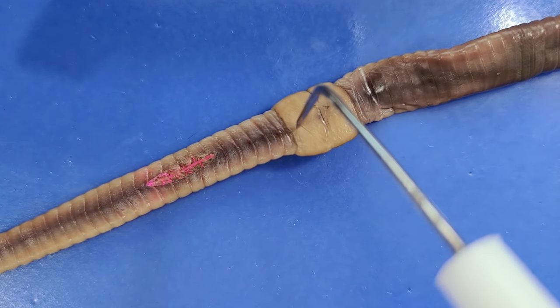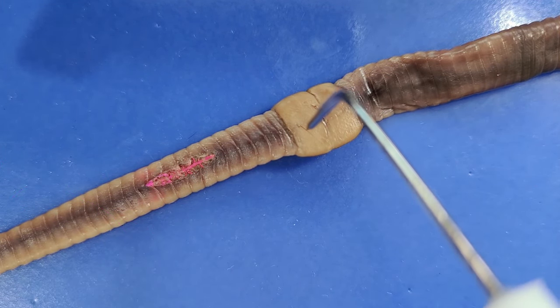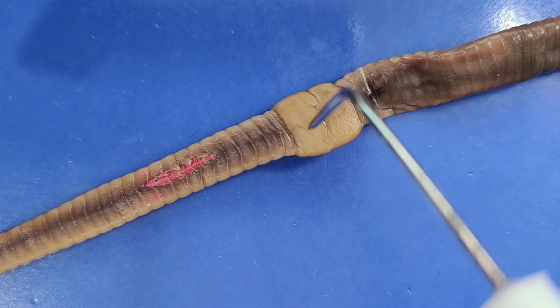You can also see this raised band on one end of the worm. This is called the clitellum, and its function is to secrete a viscous fluid that forms a cocoon for the worm's eggs.